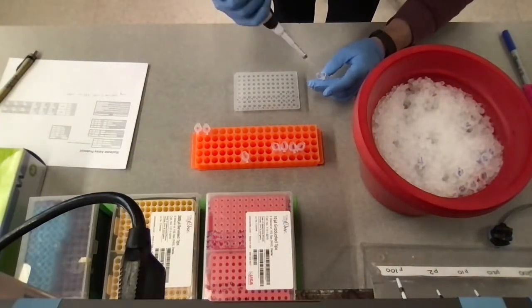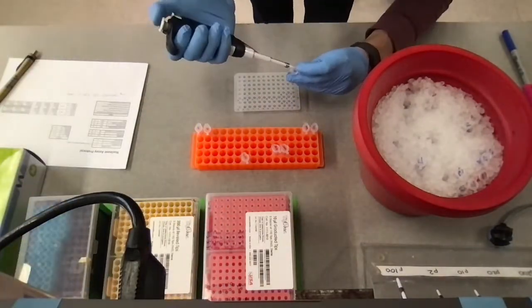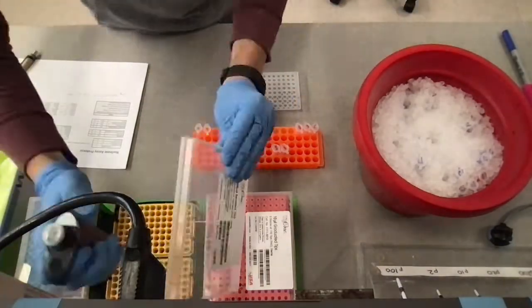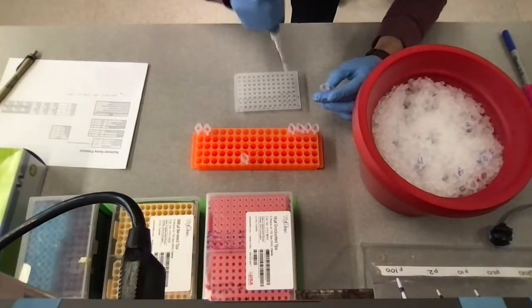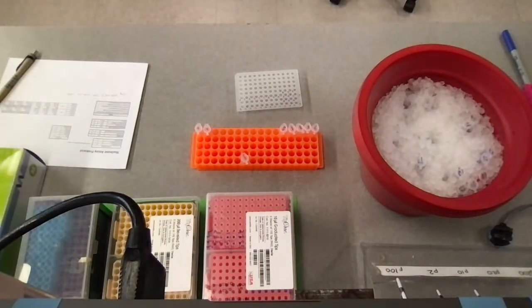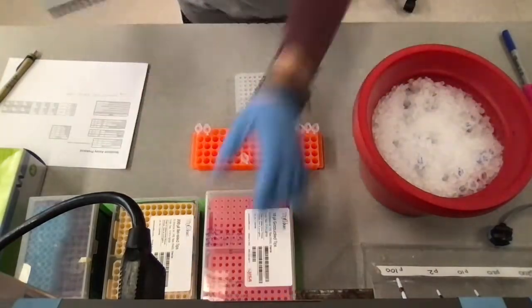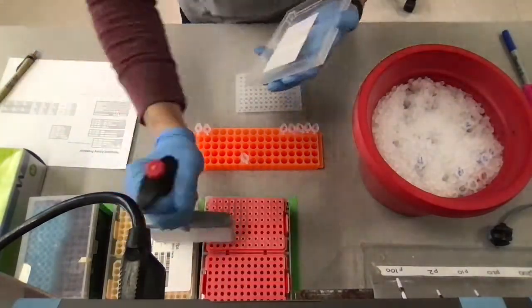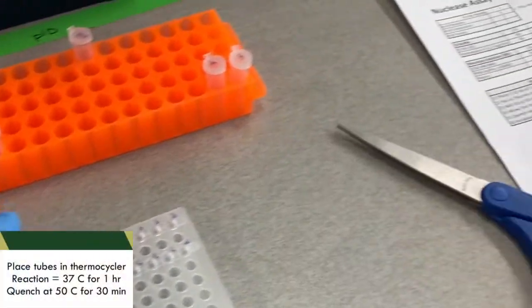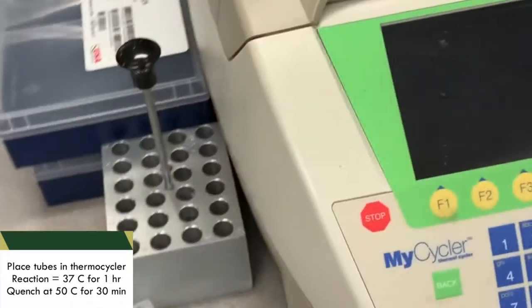Then I'm going to go ahead and load in some proteins down below. You'll see in just a second why I do this, but I want to be able to use a multi-channel so that I can transfer all the proteins pretty much at the same time. So here we go, transferring the protein in, and then at this point we'll have protein mixed with DNA.